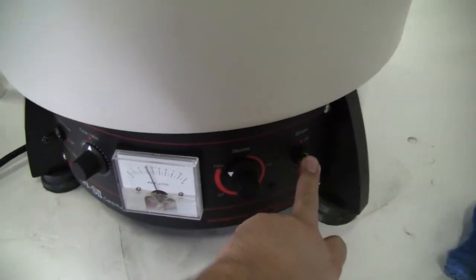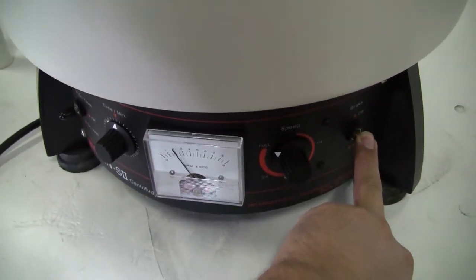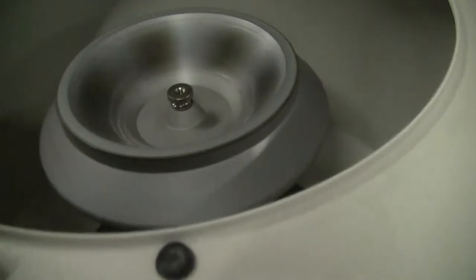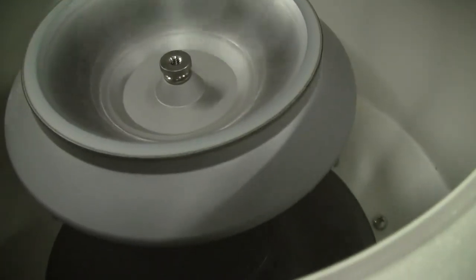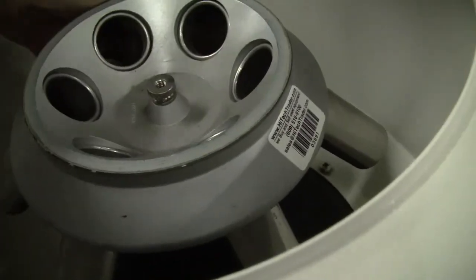Let it wind down. We can put the brake on. Wonderful. Taking a look.